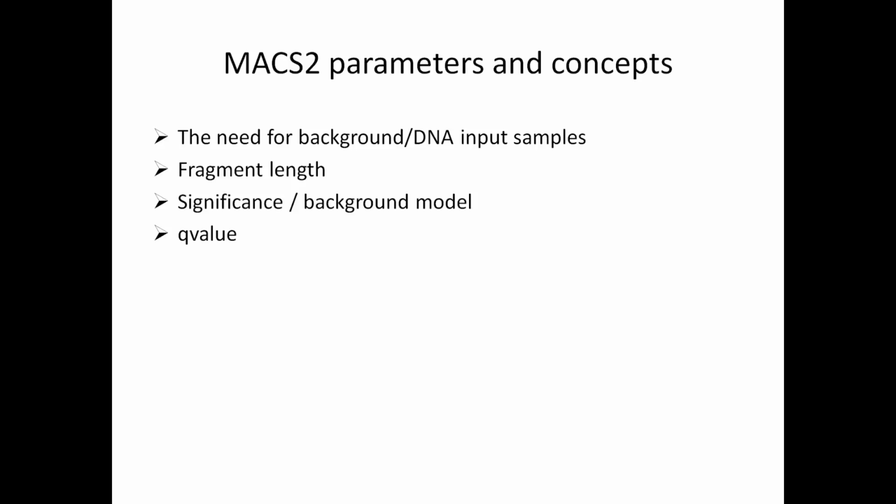Very simply put, if you had tens of thousands of binding regions, each with a p-value cutoff for deciding whether it's a true peak or not, a p-value in itself is saying that there's a certain chance that an experiment could be a false positive.